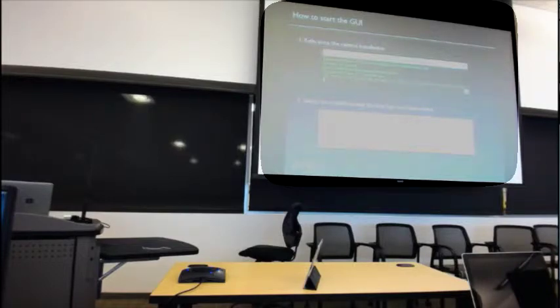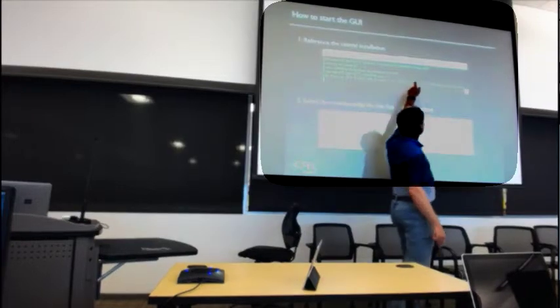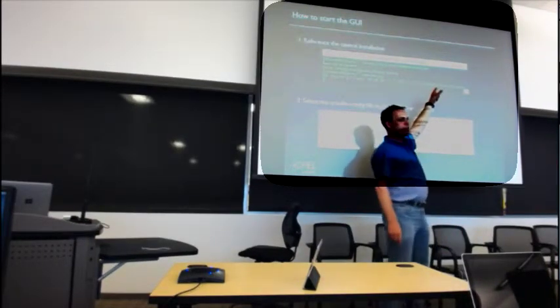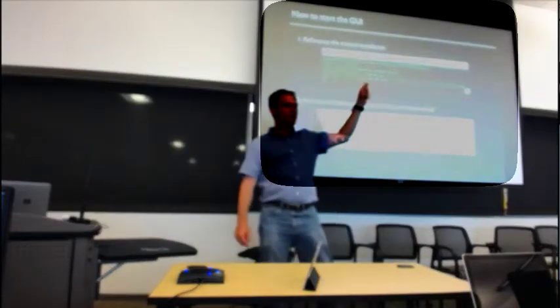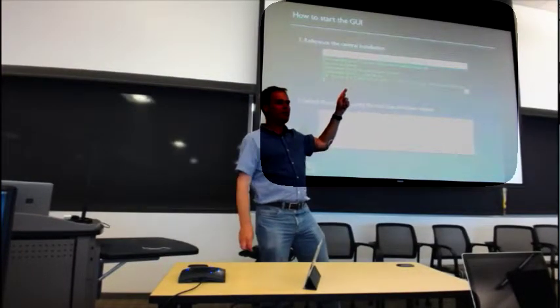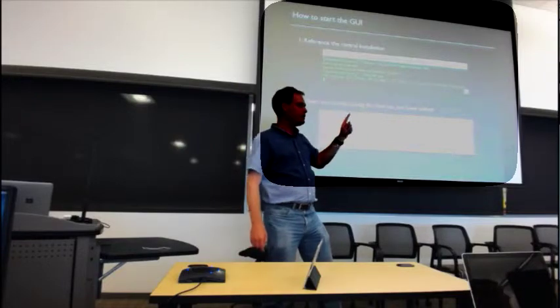If anyone happens to still be using Bash, then you just do the Bash setup.sh. Yeah, I personally don't test the sh thing as much, so I hope it works. I don't have permission to scratch. Okay, that's an experiment.